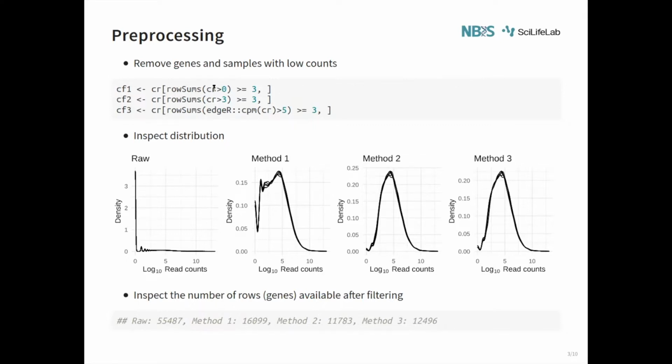If you're using a package, then this is actually performed within the package. So it's not super important that you do it, but I generally do it. And it is, I think, good practice to remove bad genes right at the beginning. And there are many ways to do this and many different strategies to go about doing this. So here are 3 different ways to do this.